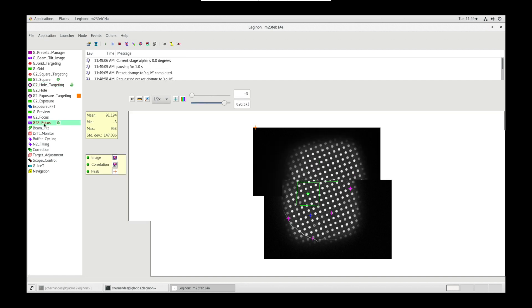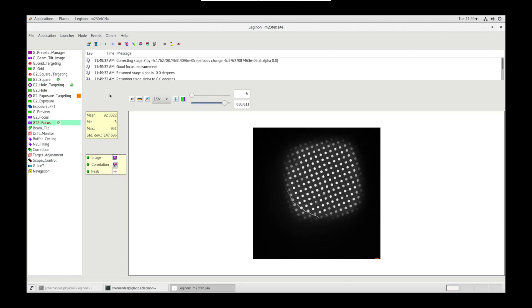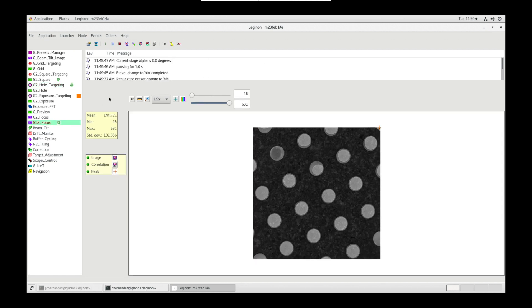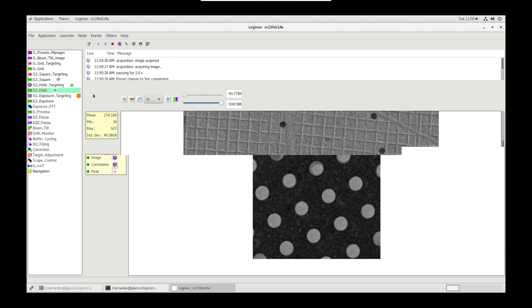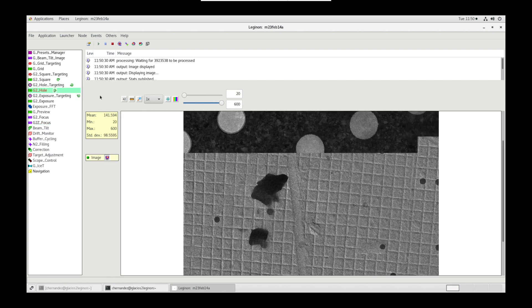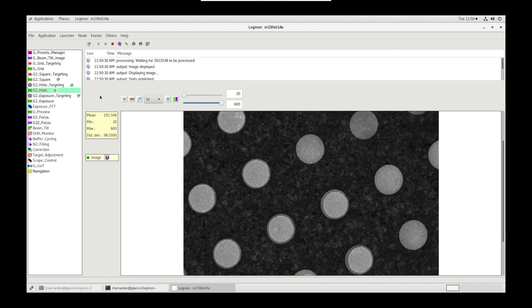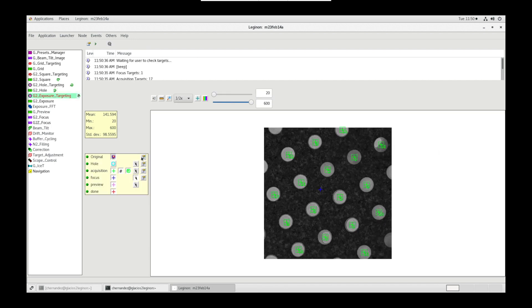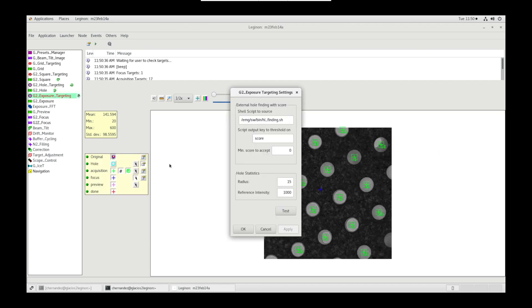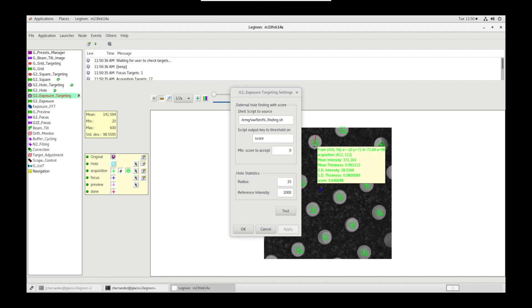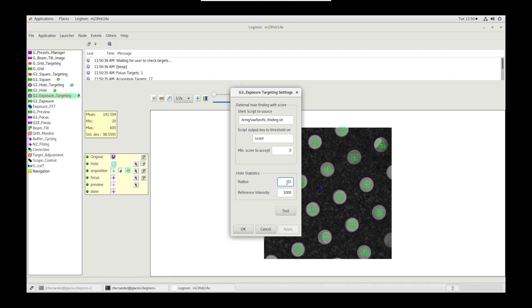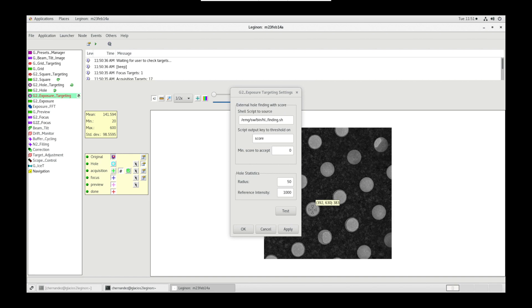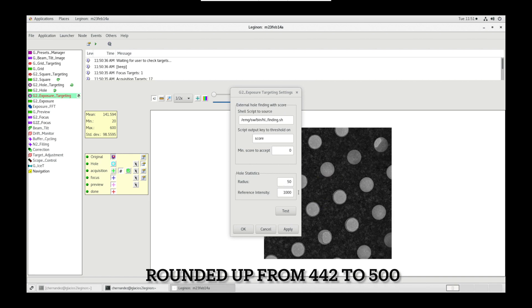The focus node will automatically find the eccentric height for this square. Now let's go to hole node, which will display the hole magnification micrograph, and exposure targeting will be waiting for our input. In exposure targeting node, hole settings, make sure the minimum score to accept is 0 or less. Then, use the ruler tool to measure the radius of the holes and input this value. Then, let's use the show value tool to measure the reference intensity and input that value. You can then click test.